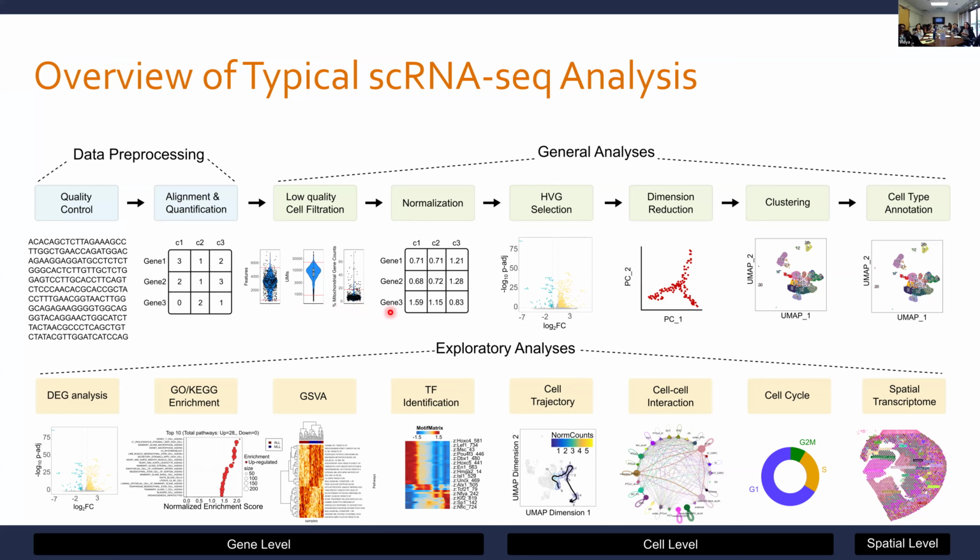And then the next typical procedure, and we talked about this a little bit in the statistical methods meeting, is normalizing. You normalize not for differential expression analysis, where you would still use the raw counts. You normalize for dimensionality reduction, clustering, and a lot of the visualization procedures, so that you can look on a plot in a fair manner and say, does this look higher or lower than the other one? The one approach we talked about a couple weeks ago is typically you take the log of these counts plus 1. That way, if you have a 0, you don't have an issue with taking the log of 0. And then you scale that by some factor, typically 10,000, and that gives you your normalized count matrix.